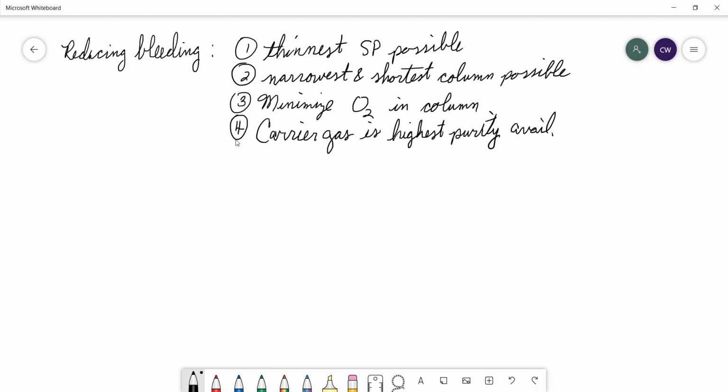So whenever we're buying helium for our GCMS at the university, we buy the purest helium we can get, medical grade helium, okay? Which is 99.9999 9, I think, percent pure. Okay, so we're talking pure down to 10 parts per million. No, no, 1 part per million. Sorry, did my mental math.